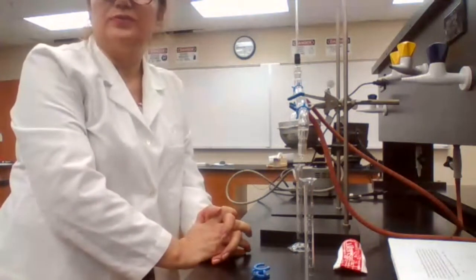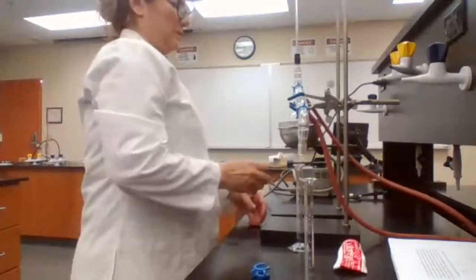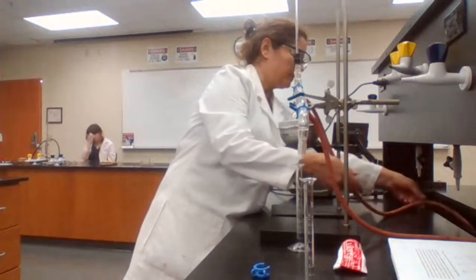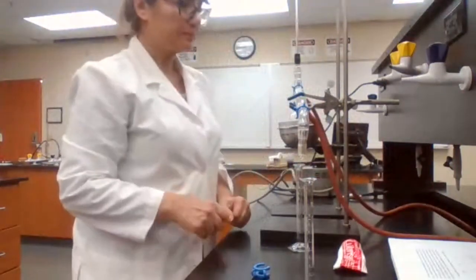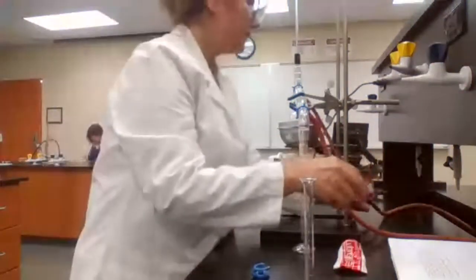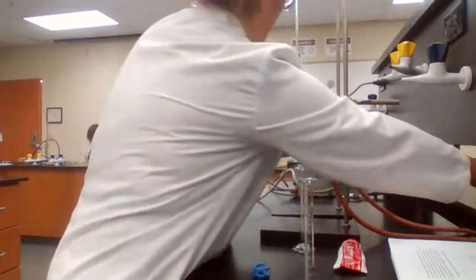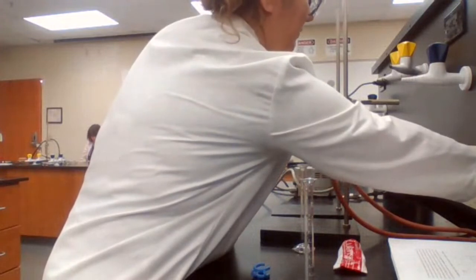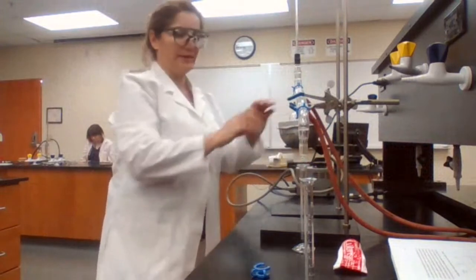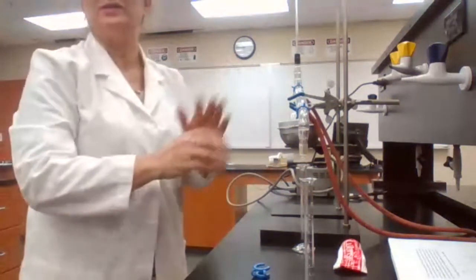Okay, your answer to the first question. Water splashes. When we do distillation, we often have a trip to Splash Mountain, and it happened again, but it's okay. It's working now. The only thing I worry about is the water getting on electronics, so I keep the electronics on one side, water on the other side. I try to.